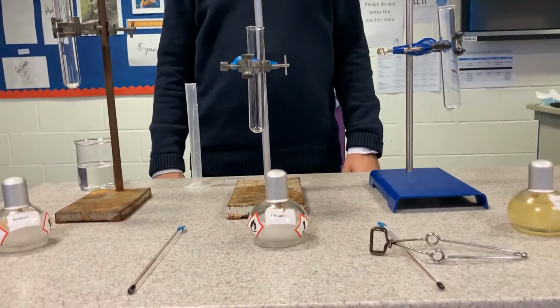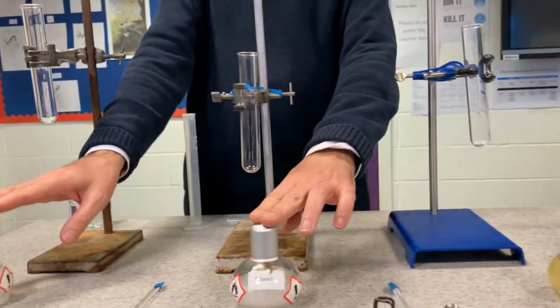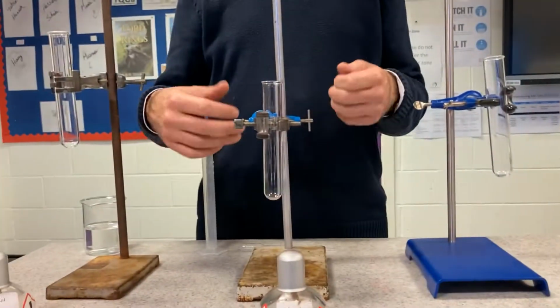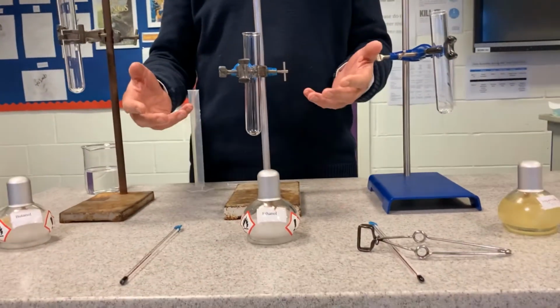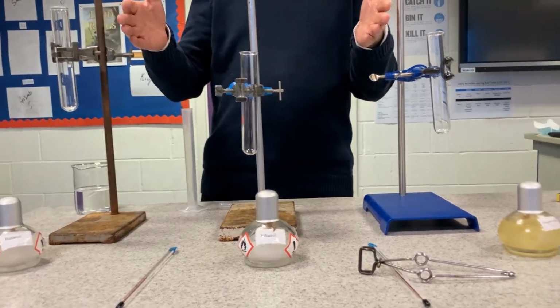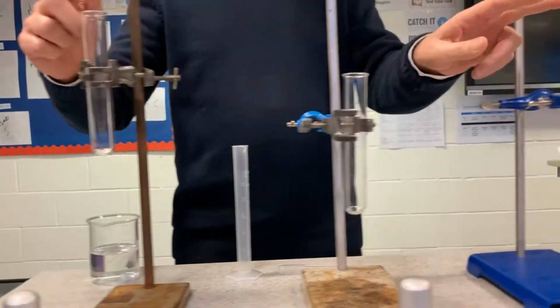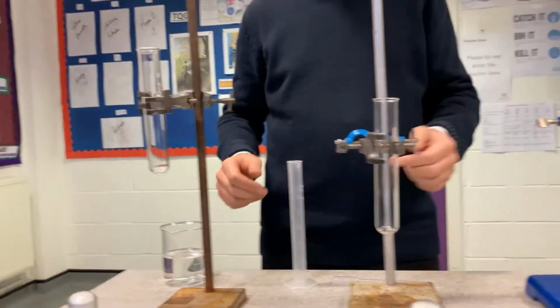Right there, today we're doing an experiment to find out which of these fuels is the best fuel. So we're looking at which has got the most energy and various things. So this is the equipment I'm going to be using. Now I'm going to be heating up some water. I'm going to be putting some water in these and we're going to see how hot they get.